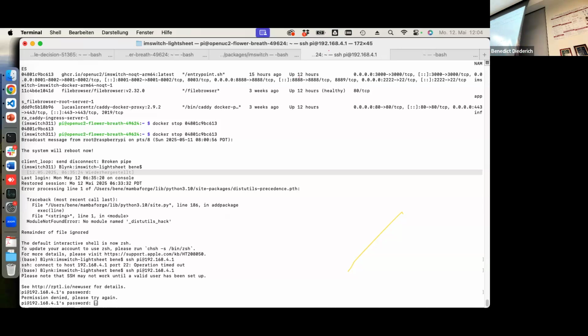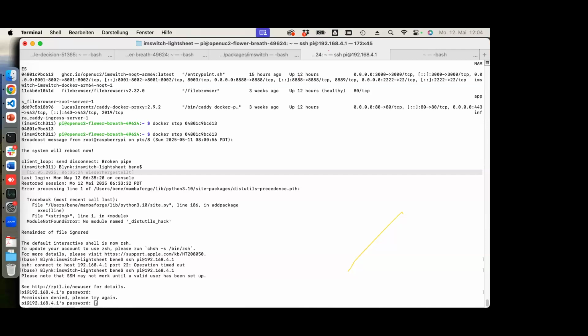And if you have an iPhone, if you open it the first time, you can see dust, it's really hard to see. Yeah, here you could prove the whole thing. And it would survive for sure. We have to set it in a standard. Yes, that sounds good for me. Well, thank you so much. Yeah, nice. Thanks. Thank you, it was nice.